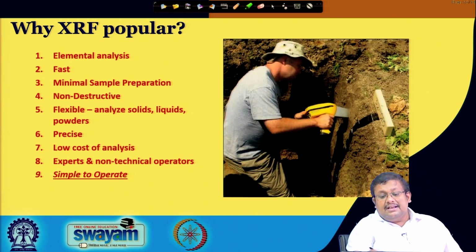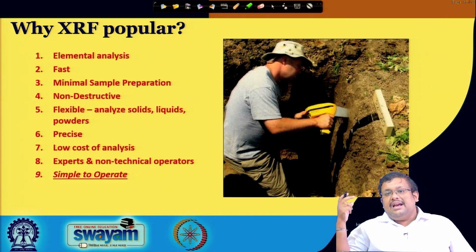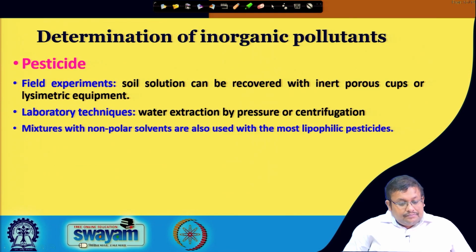You can see here the scientists are using this handheld XRF or handheld EDXRF directly in the field for measurement of elemental concentration in the soil. So, instead of bringing the samples into the lab and going for the cumbersome methods, you can directly go to the field and measure the elemental concentration in the field itself.